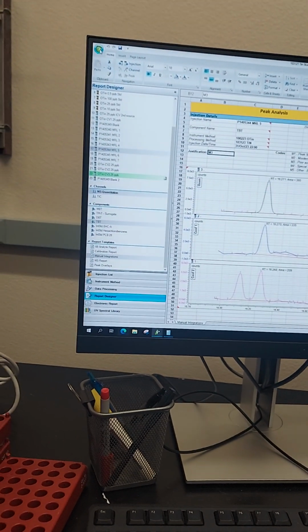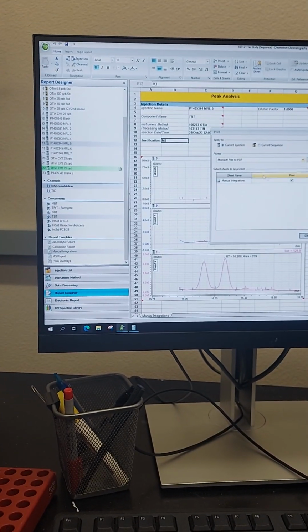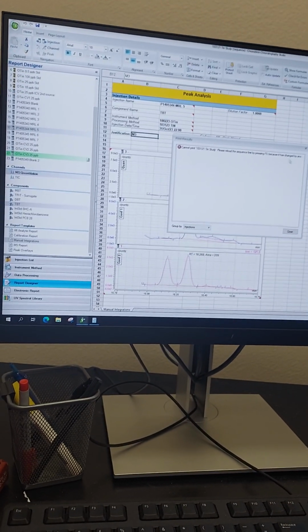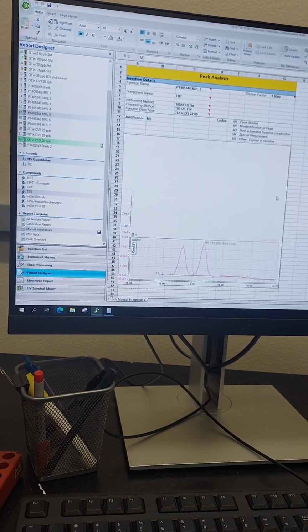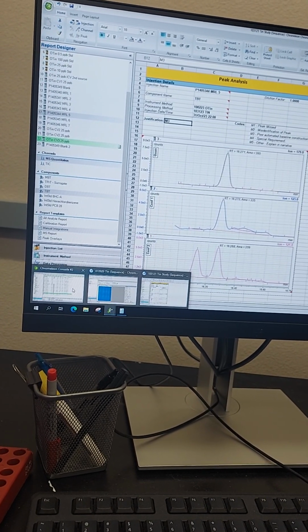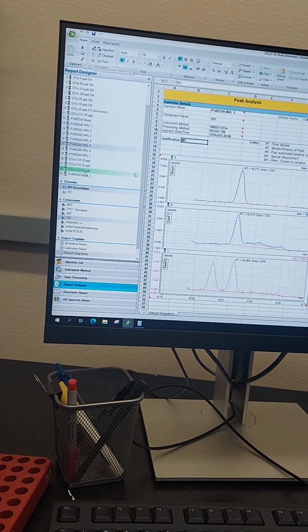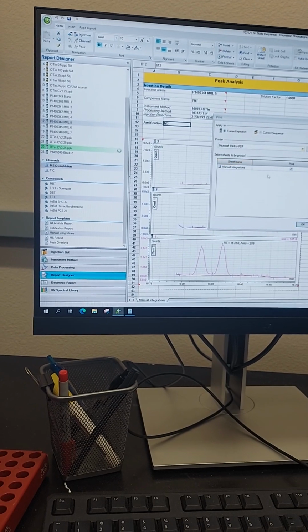Okay. And then let's click the Chromeleon icon, and then print. Print as a PDF? Is that what I want? I believe I want a PDF. Please reload by pressing F5 because it has changed. Oh yes. Okay, I need to refresh because we updated the sequence. So this needs to be refreshed. It said press F5. Okay. So now this got added. But that should fix it. Prints PDF.